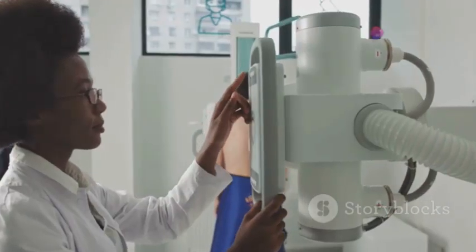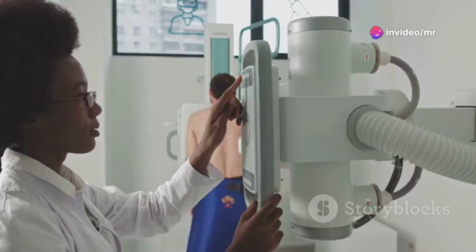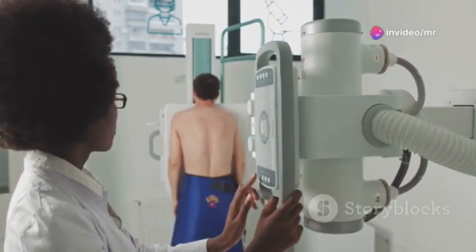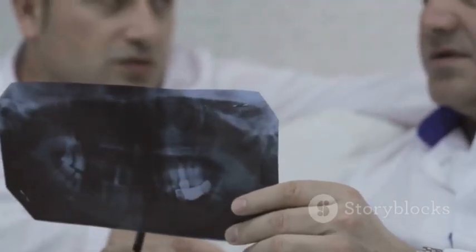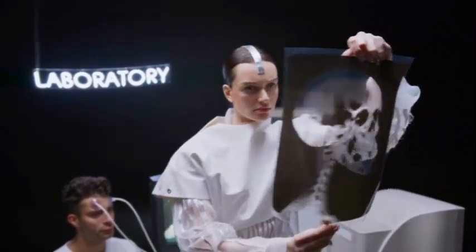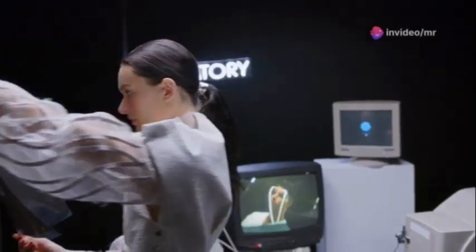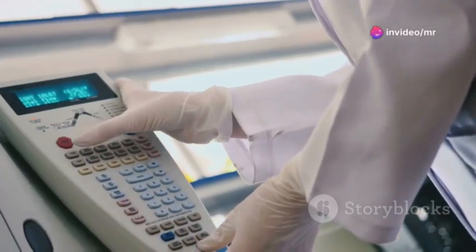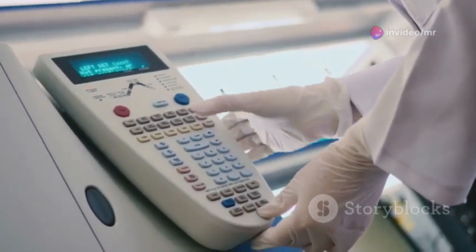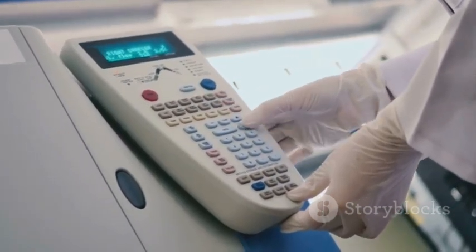We turn on the X-ray source and aim the X-ray beam at our sample. This is where the magic happens, as the X-rays penetrate the material. The X-rays interact with the atoms in the material and scatter in different directions. This scattering creates a unique fingerprint for each material. The detector picks up these scattered X-rays and measures their intensity. The data collected will help us understand the material's structure.